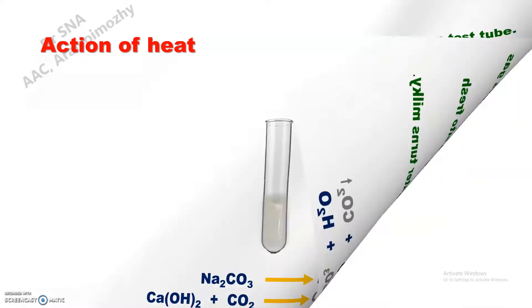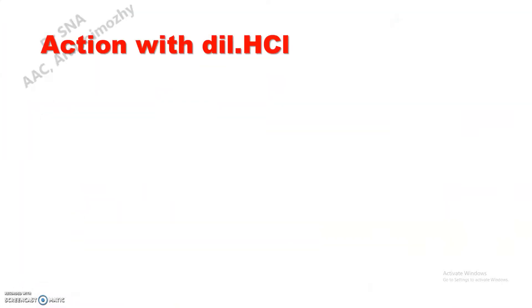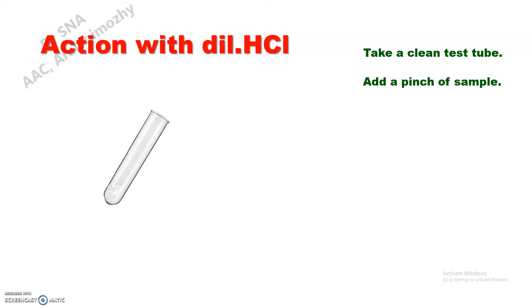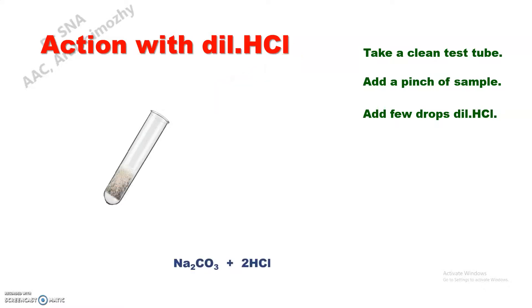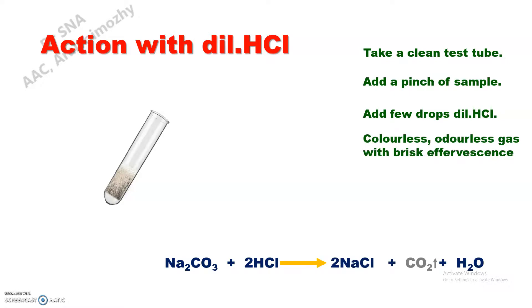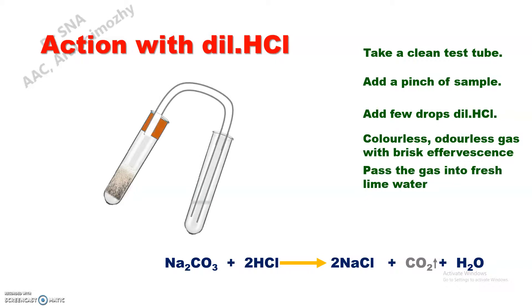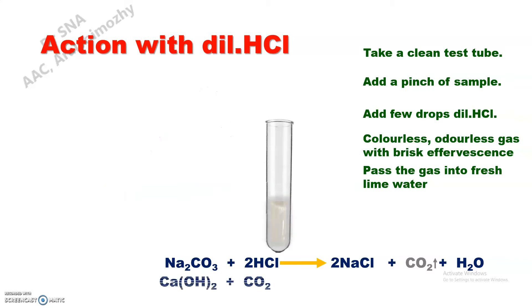Next: action with dilute hydrochloric acid. Take a small amount of sample in a clean test tube and add a few drops of dilute hydrochloric acid. Brisk effervescence is observed, due to the evolution of carbon dioxide gas. This is further confirmed by passing the gas into another test tube having fresh lime water, which turns milky due to the formation of calcium carbonate.